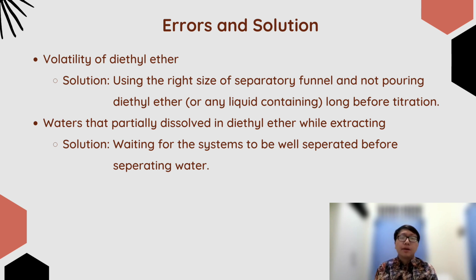And the second is water that partially dissolved in the ethyl ether while extracting. So we can solve this by waiting for the system to be well separated before we separate the water.